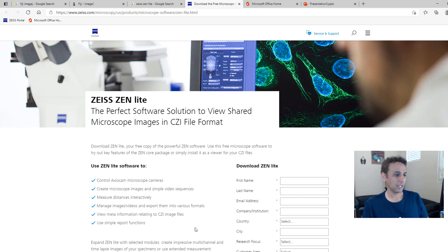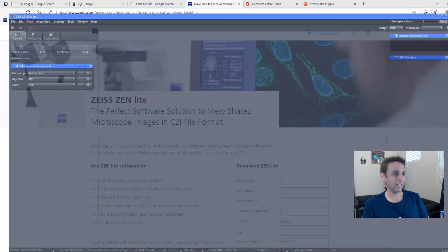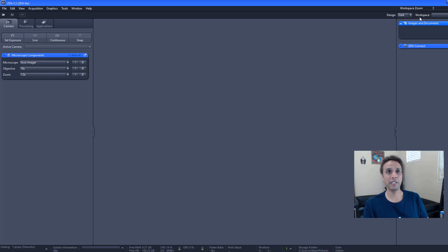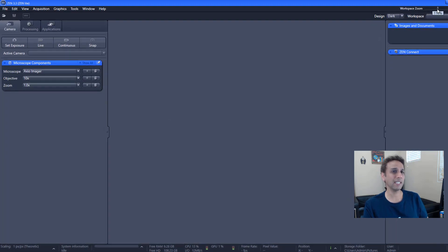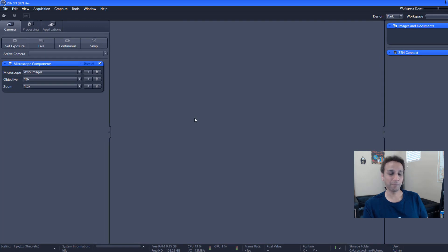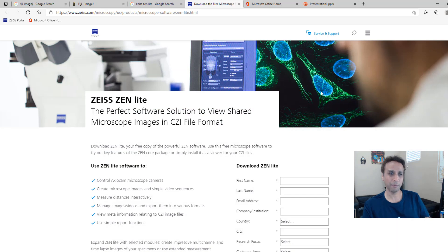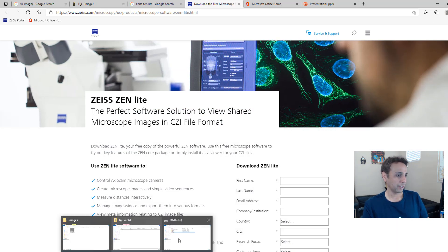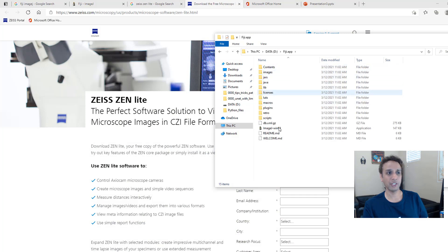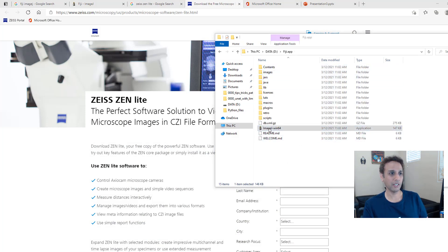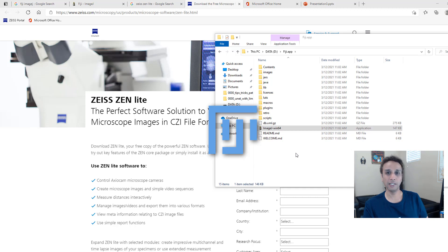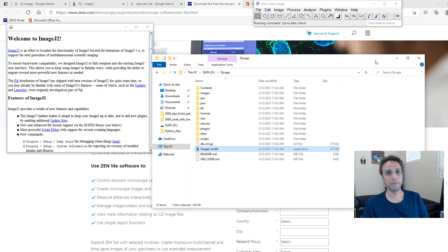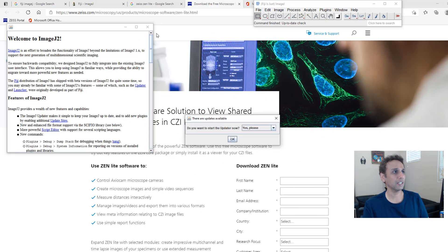Since I've already downloaded, extracted, and installed this, here is how it looks. Let me increase the workspace zoom — this is very modern, as you will see. Now since ImageJ extraction seems to be done, let's finish that and then jump back. We have our ImageJ right there. It's done. It's basically an executable — there is no installation, nothing. You just open this and it should open ImageJ.